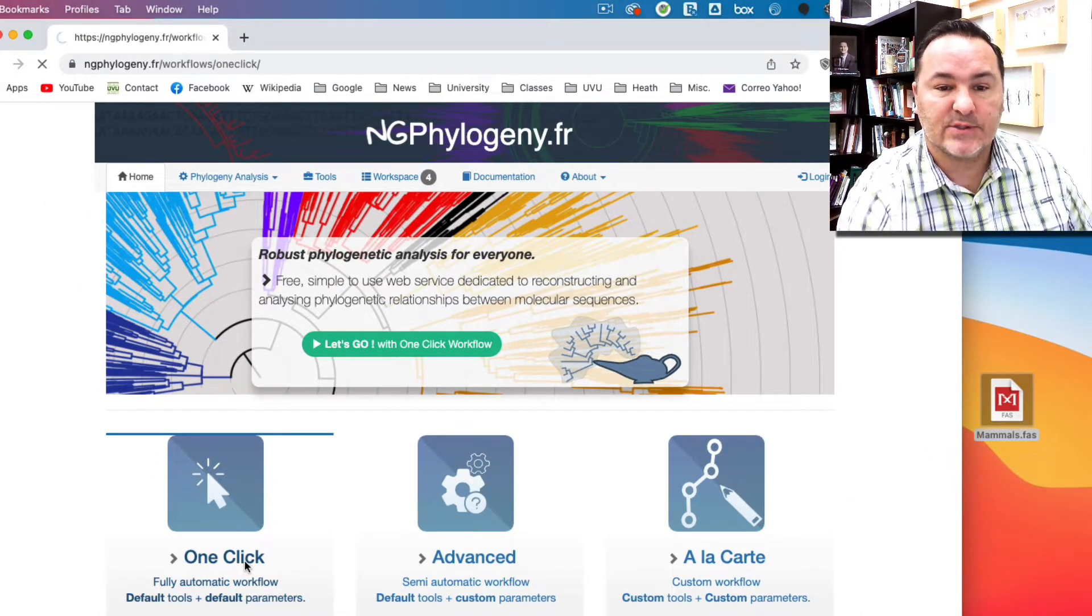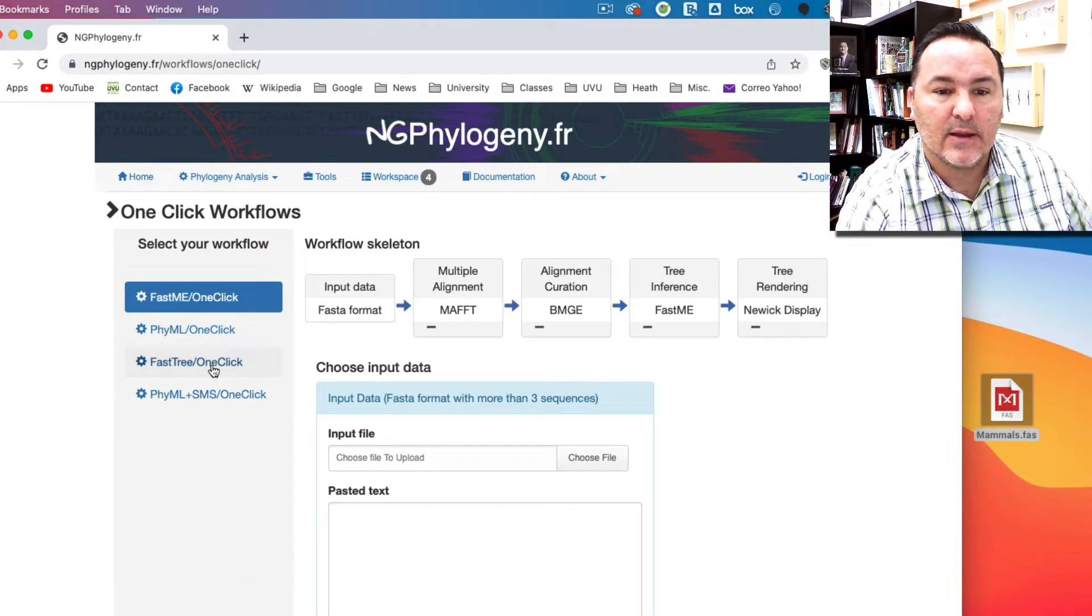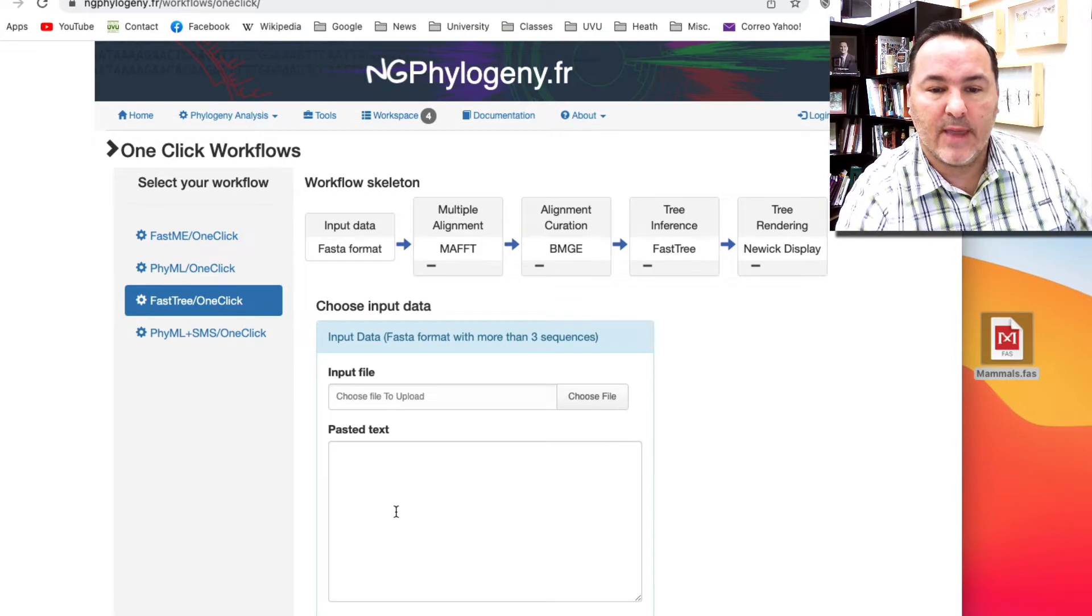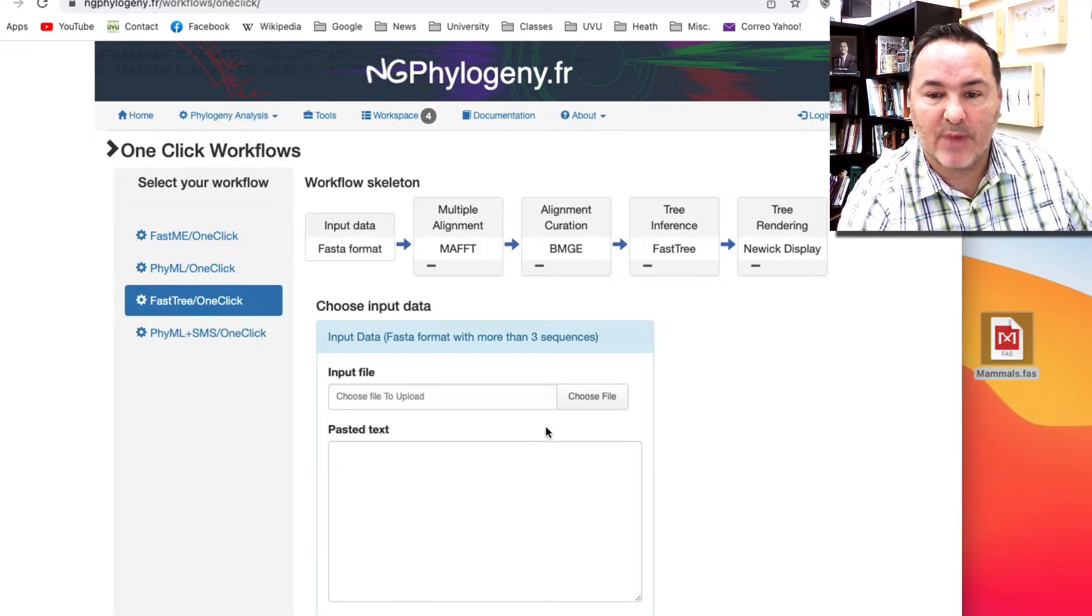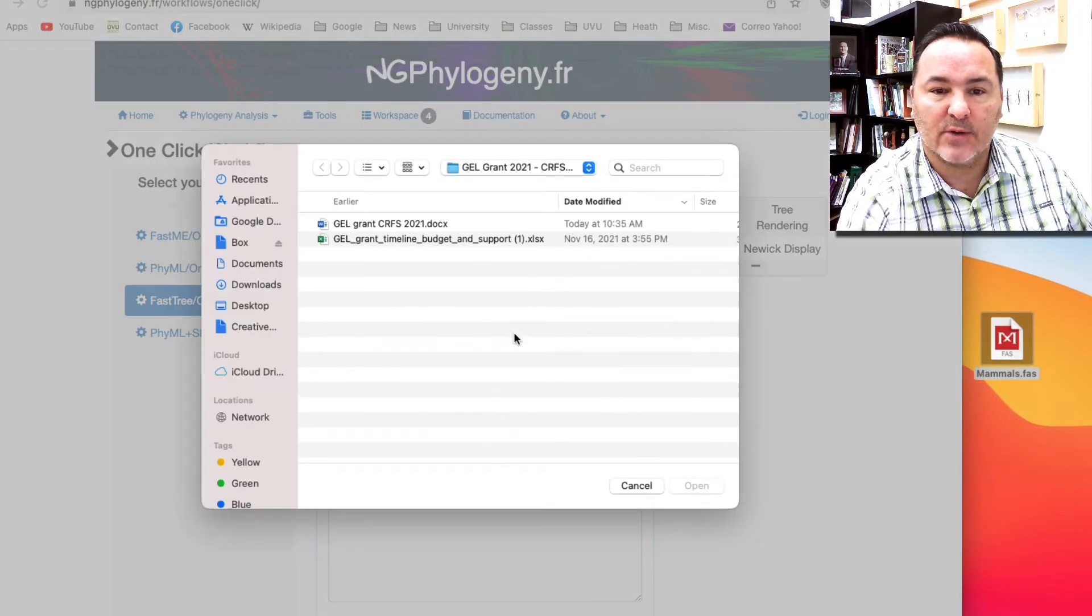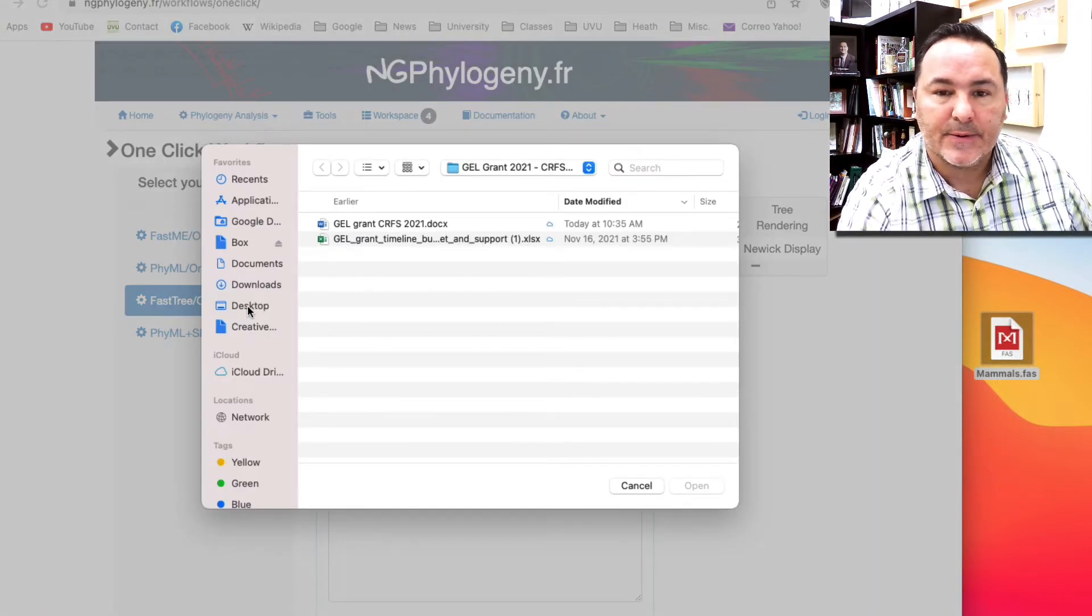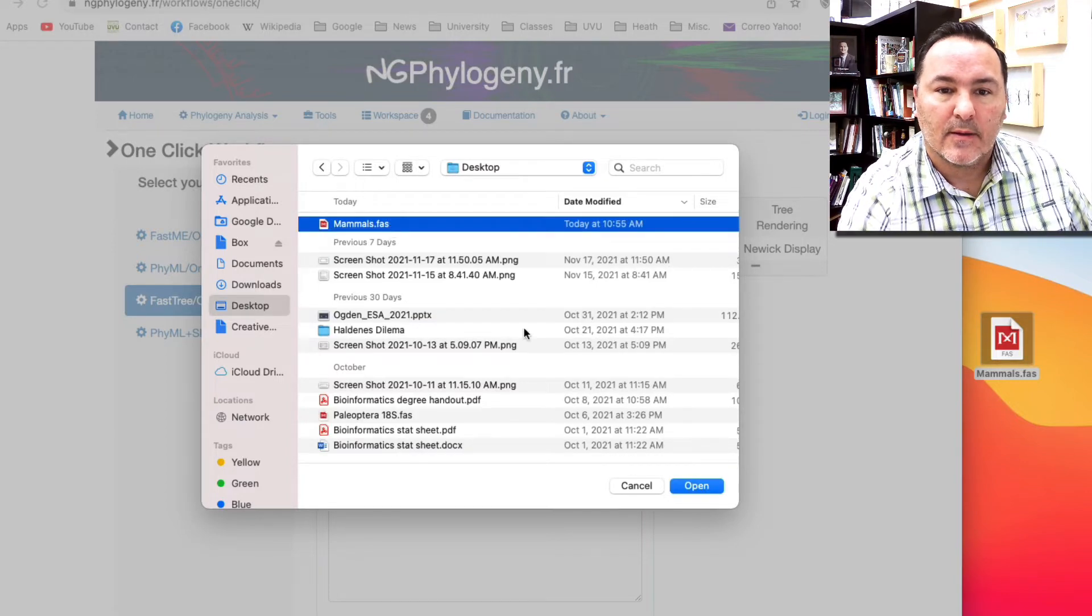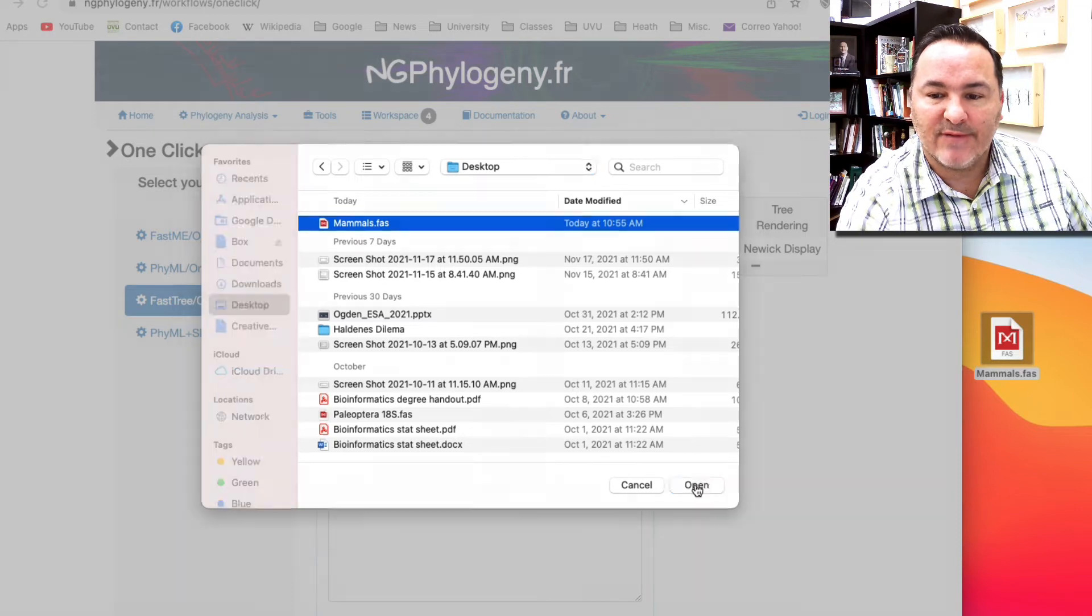Let's start with just the one click. Let's use the FastTree one-click. I'm going to click on that workflow and then I need to find my data. I could just paste it into this box or I can choose a file. I've got a file that's ready to go on my desktop here that I created, it's called mammals.fas.